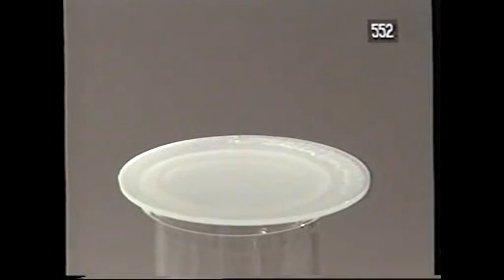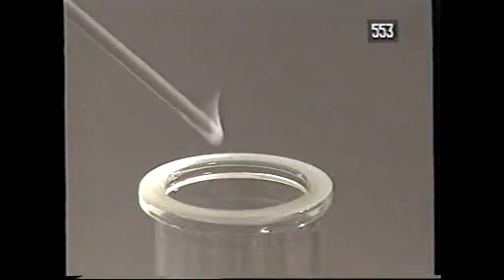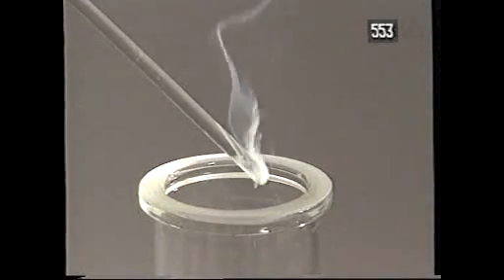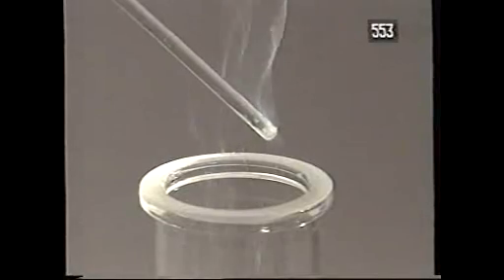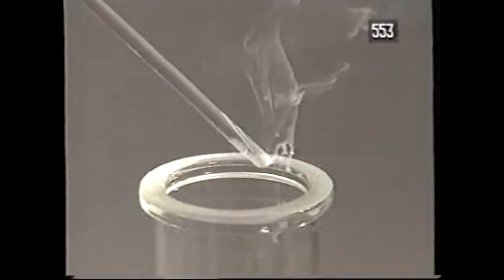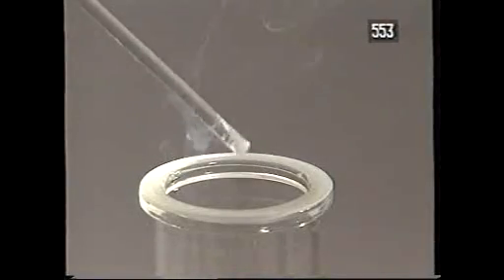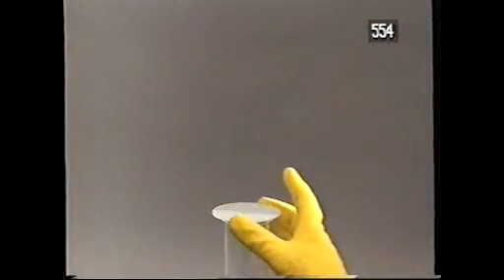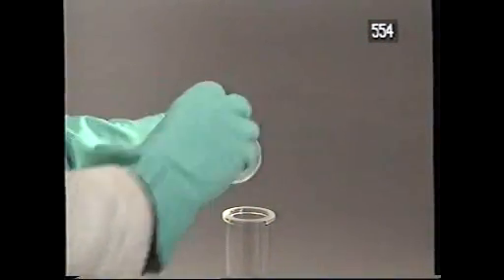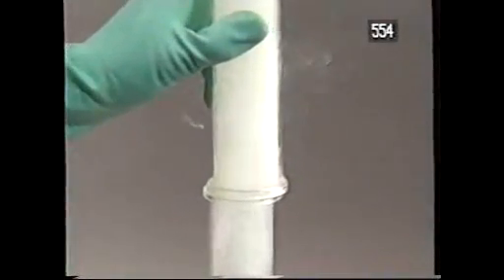But it isn't difficult to turn ammonia back into ammonium chloride. All you need is hydrogen chloride. Here, I'm using the hydrogen chloride released by a drop of concentrated hydrochloric acid on a glass rod. When the drop is put into ammonia, white fumes of solid ammonium chloride appear. Alternatively, I can just put gas jars of ammonia and hydrogen chloride together. And those white fumes are ammonium chloride.